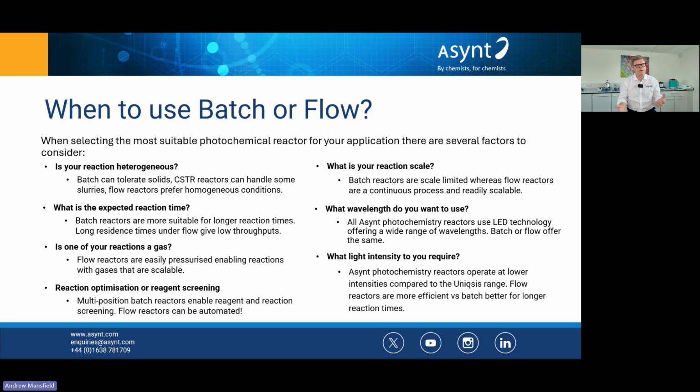So having a system where we can choose the intensity of our light source, whether that's dialable, whether that's having a variable control to change the light intensity, or just access to low and higher light sources, really gives you the breadth of light intensity that you might need.